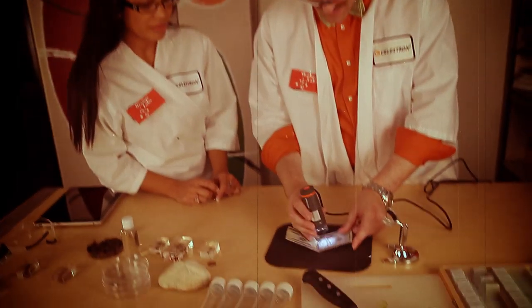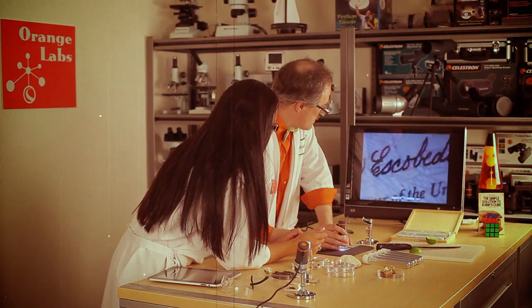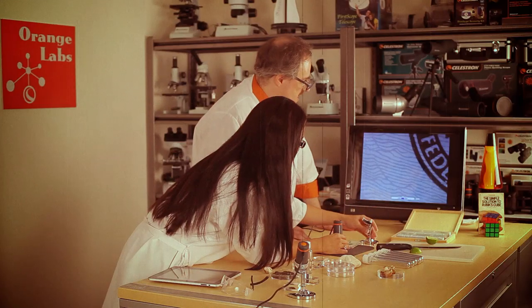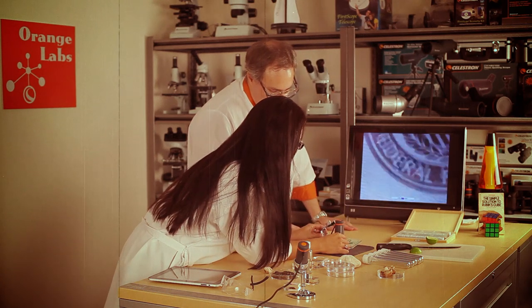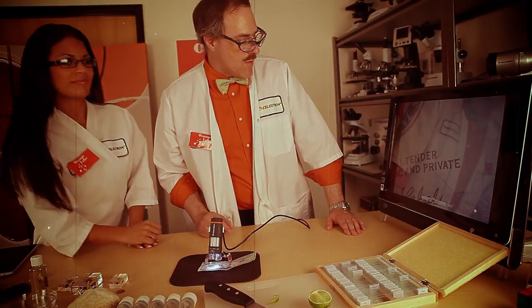A $20 bill. There's some microtext on some of these. There we go. There's virtually an unlimited number of things you could look at with this. And you can put it right on the stand and see it at 40 power.